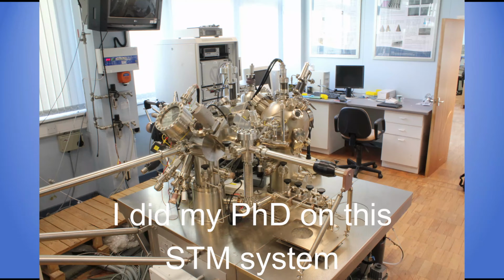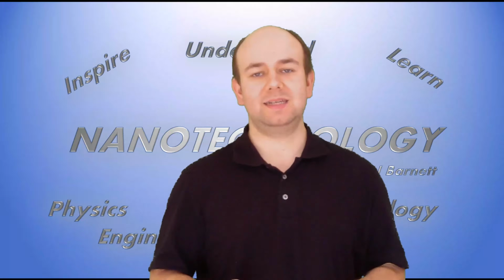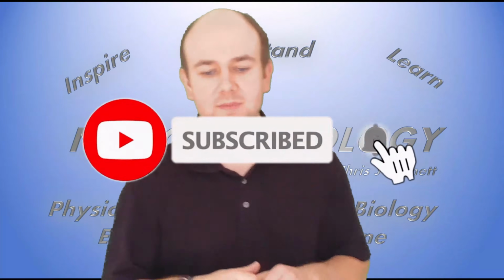So STM has a number of different uses. It's also used for atomic manipulation and also looking at electronic states in structures. However, I'm going to put those into a different video. In this video, I'm just going to give a brief introduction to how STM is used to image a surface and look where atoms are in that surface.